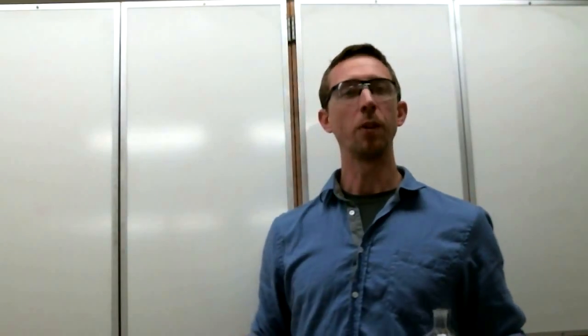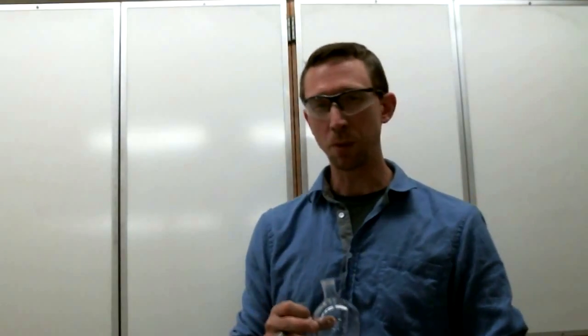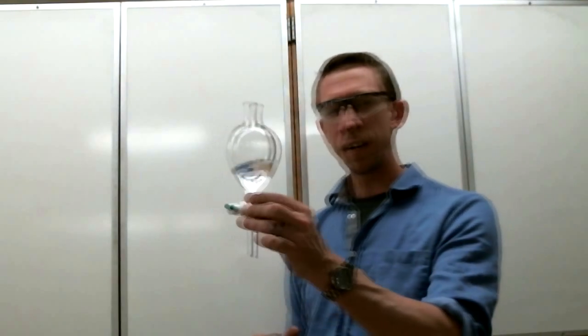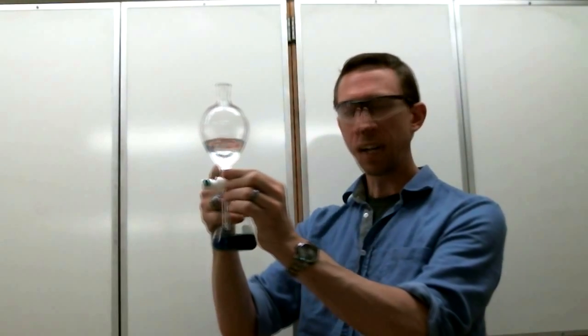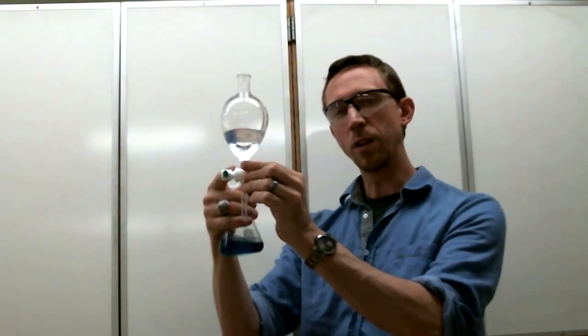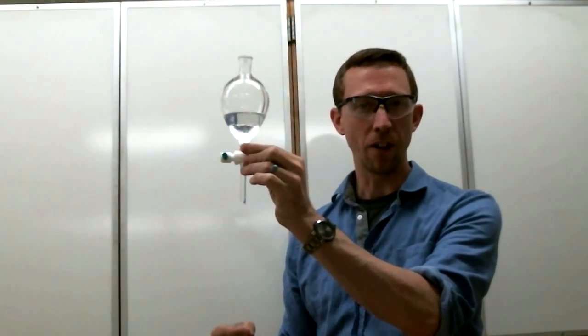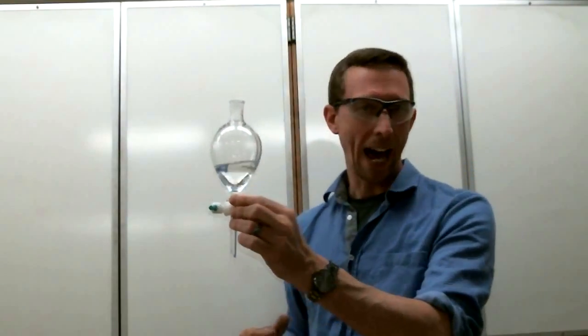about a technique called liquid-liquid extraction. In fact, I'm going to give you a very basic introduction to the principles behind it. Now, this device right here is known as a separatory funnel, and it contains a pear-shaped body with Teflon stopcock, which I can use to drain liquids through the bottom, taking them out of the funnel. And of course, there's a port here on top through which I can add liquids.